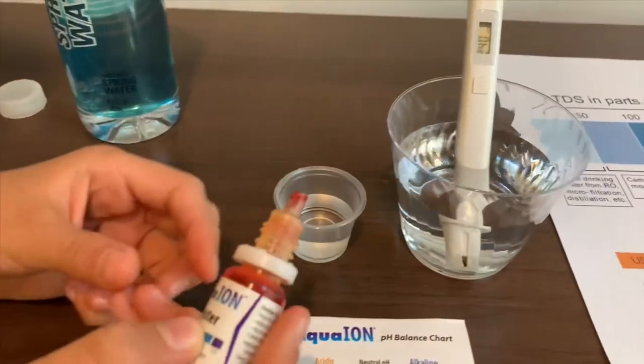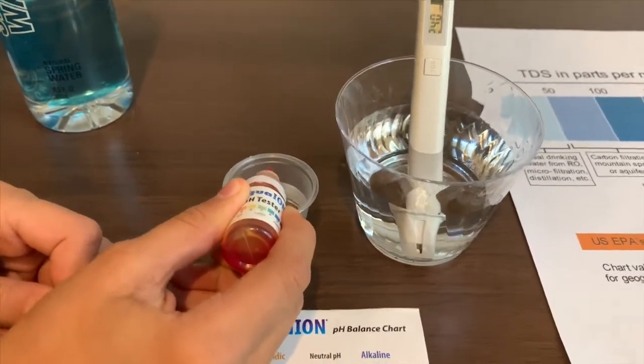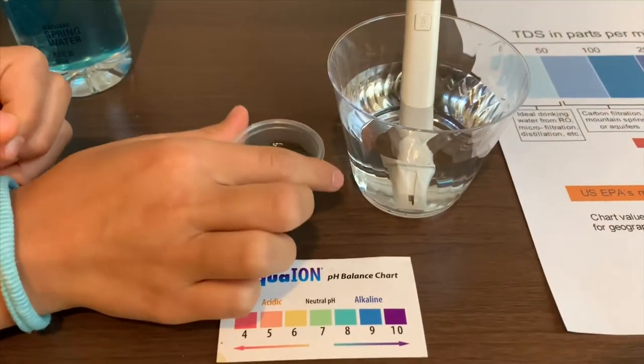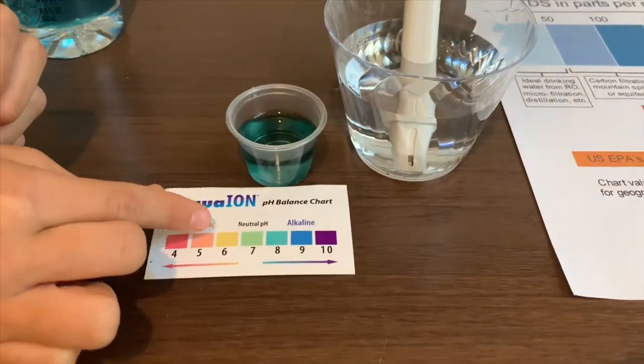Let's test the pH level. Two drops only. I think that's about an 8.